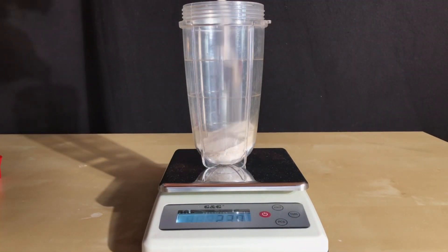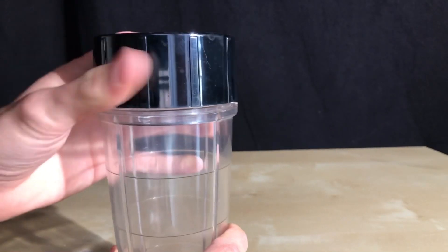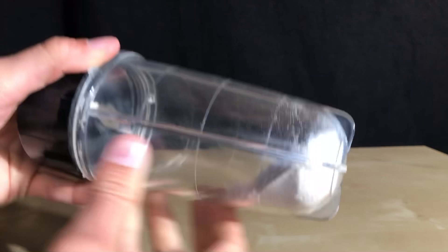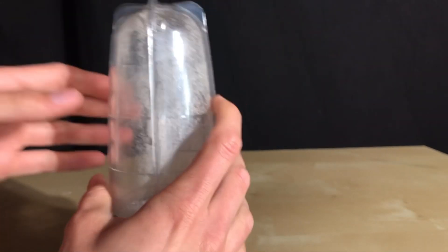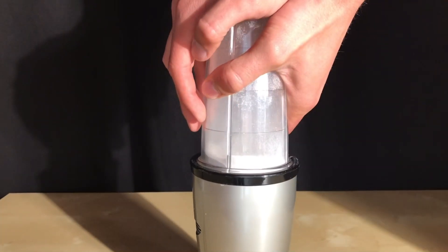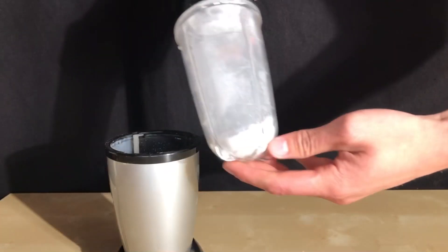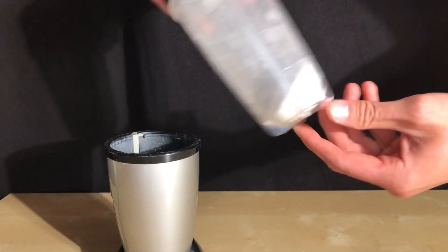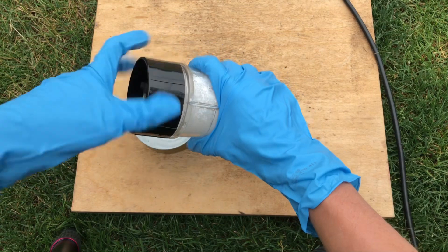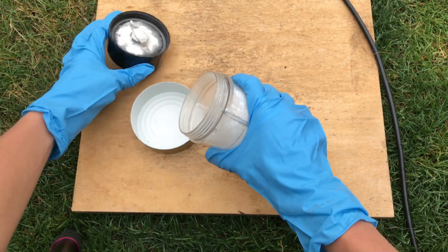We weighed out the quartz sand. This sort of sand has a higher purity and higher silicon dioxide content than normal sand. The blender was closed and the powders were slightly rotated and shaken to mix them, then blended. By blending, we pulverize all of the particles and get a really good mix, which is going to increase the efficiency of the next step.